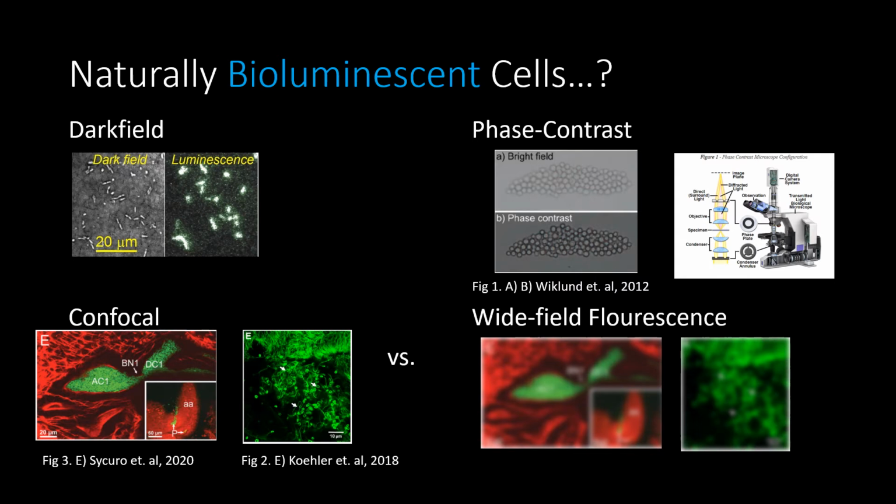Phase contrast microscopes employ an optical mechanism to translate tiny variations in phase into visual differences in image contrast. As a result, the dynamics of ongoing biological processes can be observed and recorded in high contrast and sharp clarity of minute specimen detail. Disadvantages for Vibrio fischeri, although, are that a halo can result, especially when the organism emits its own light. Here in the photo are human cells.